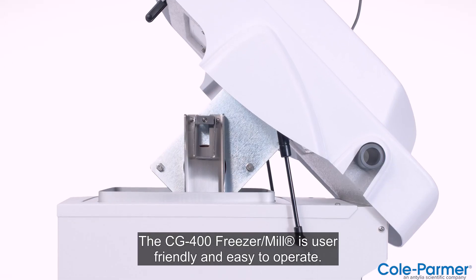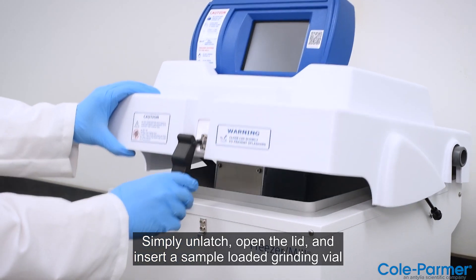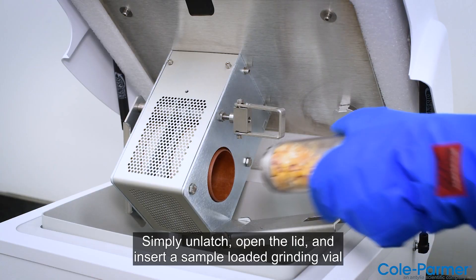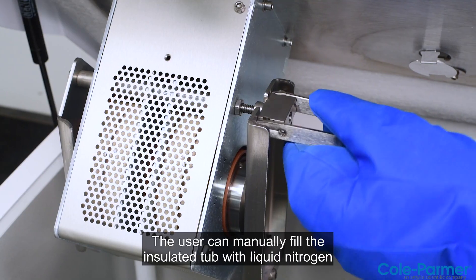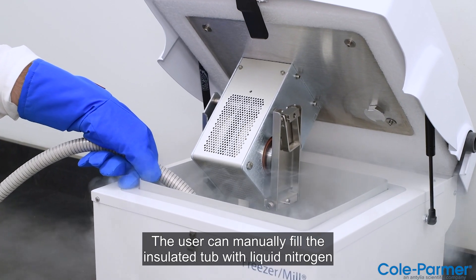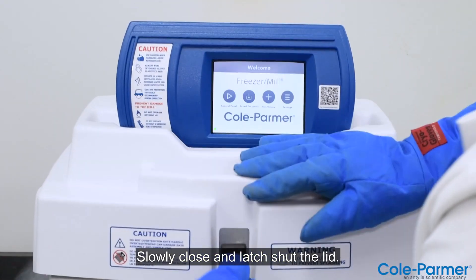The CG400 Freezer Mill is user-friendly and easy to operate. Simply unlatch, open the lid, and insert a sample-loaded grinding vial into the grinding chamber. The user can manually fill the insulated tub with liquid nitrogen up to the fill line, then slowly close and latch shut the lid.